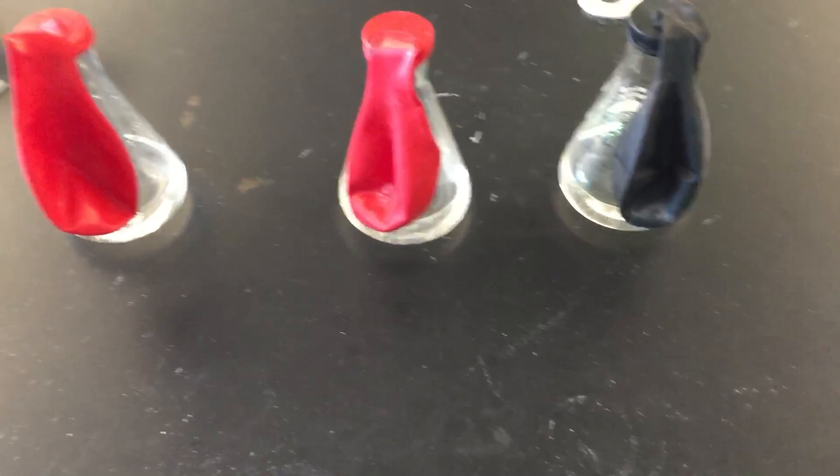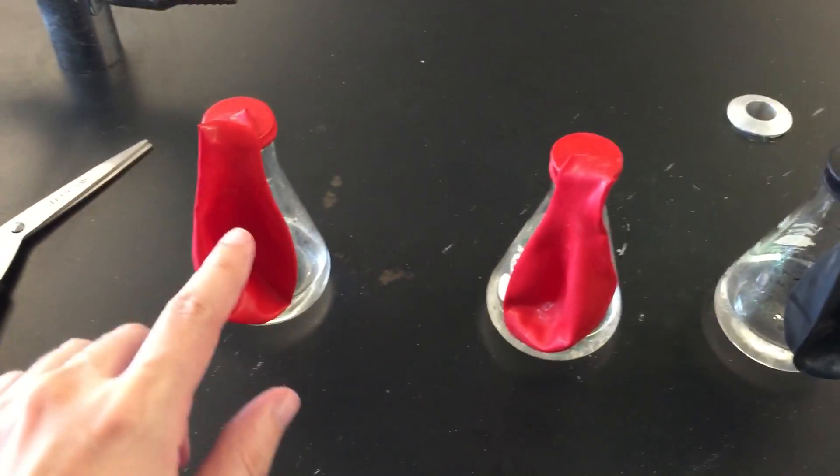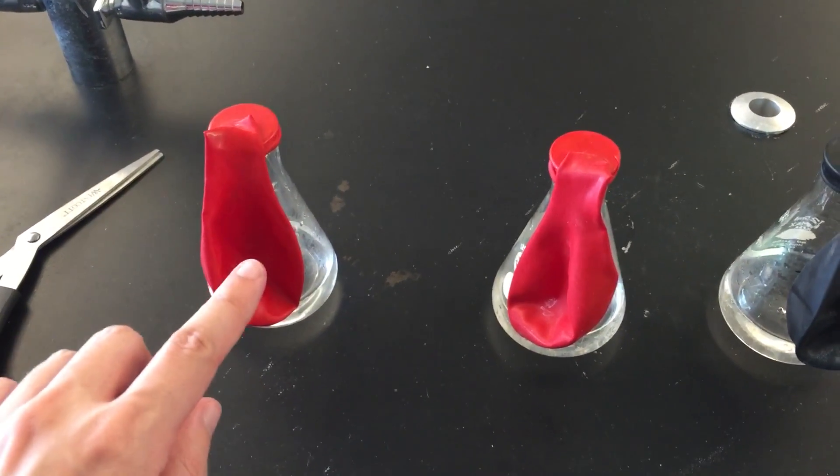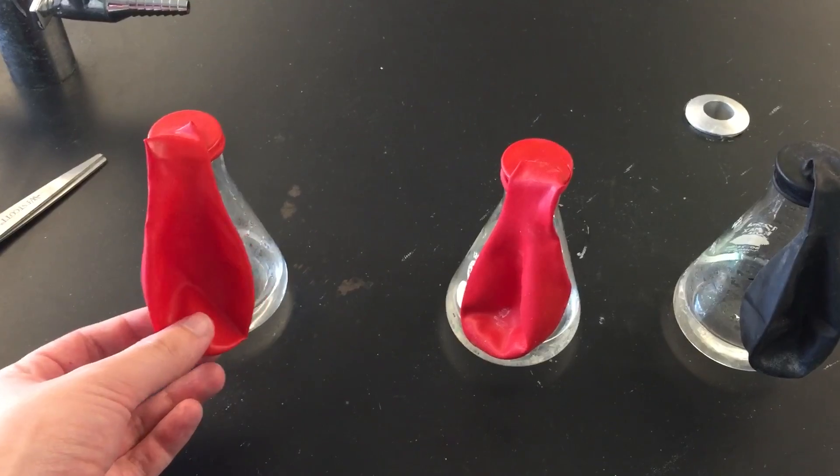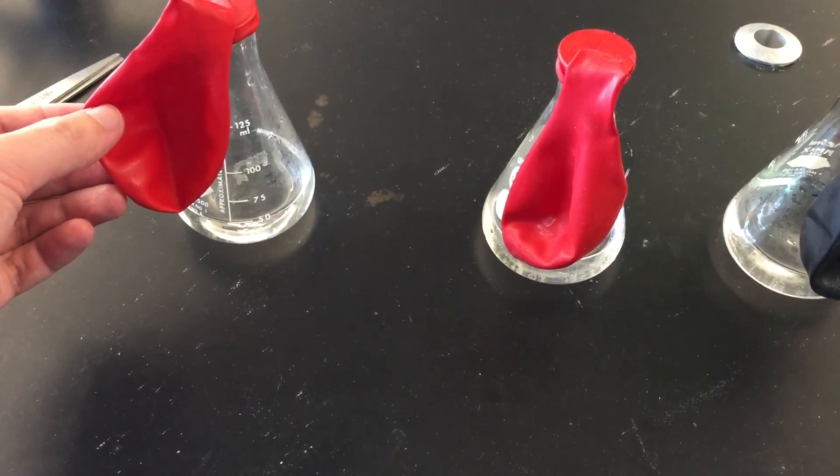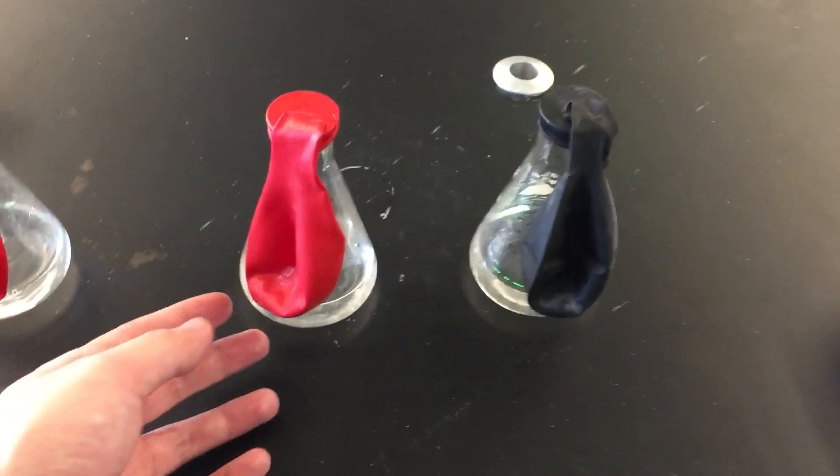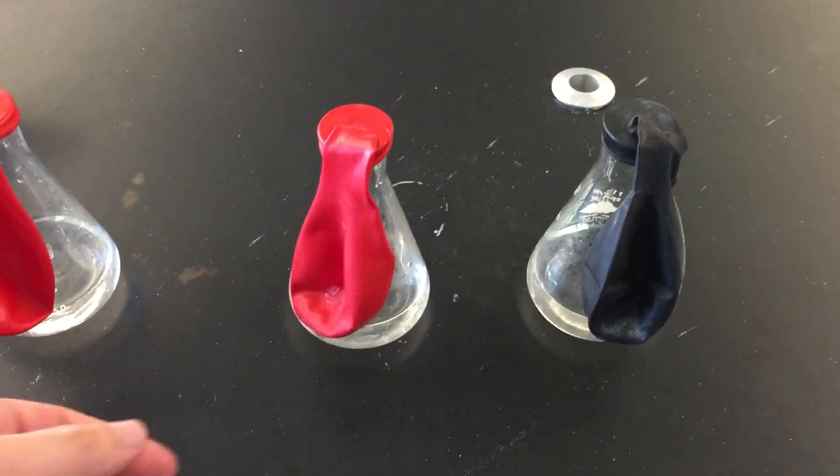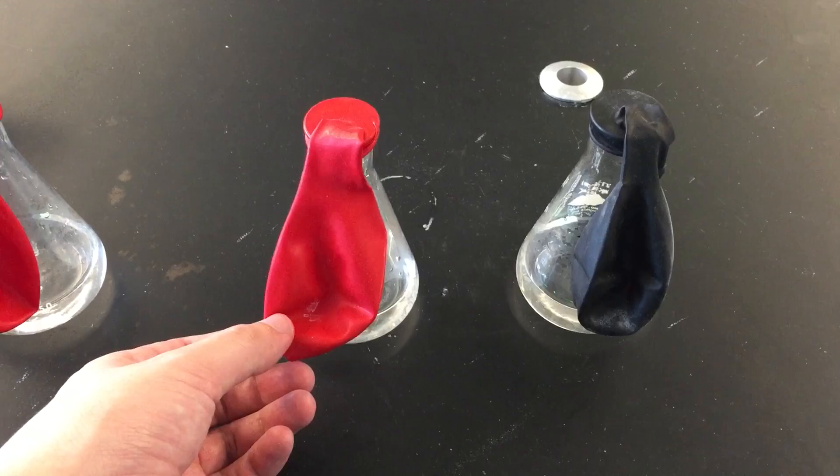So here are our flasks. This has our 1.5 grams of sodium bicarbonate inside of the balloon and you can see that there are 50 grams of vinegar in the bottom here. This is our flask number two. This has our 3.50 grams of sodium bicarbonate and again the same amount of vinegar in the bottom.